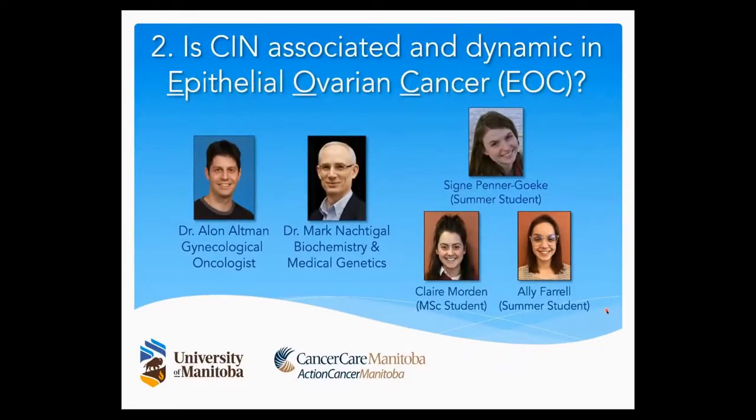So having developed these particular assays, we then wanted to apply them and have applied them in a variety of different cellular contexts. And what I'm going to present to you in the second vignette is really our efforts to discern whether or not CIN is associated and dynamic in epithelial ovarian cancer. Now, ovarian cancer is very much known to have genome instability, but chromosome instability really had not been assessed. And this work, done in collaboration with Drs. Alon Altman and Mark Nachtigal from the University of Manitoba, was driven primarily by Signe and is being extended by Claire and Ali Farrell.